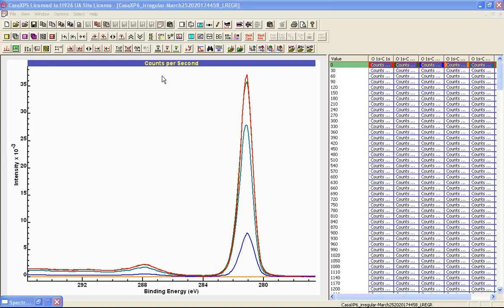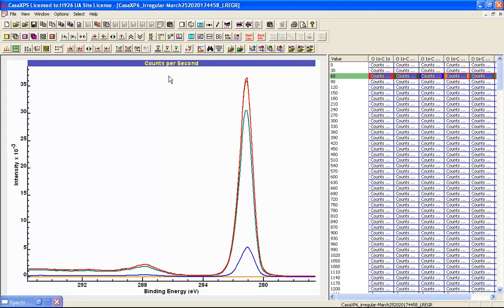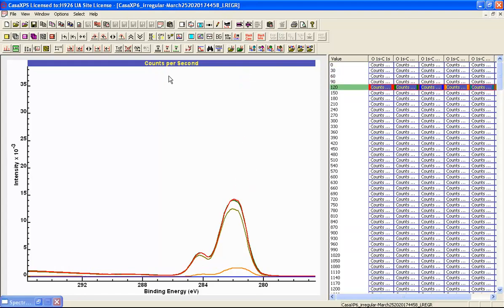A feature of using four vectors rather than two is that polystyrene can be represented by more than one polystyrene peak, and similarly there's an example of the PVP that is represented by a combination of these two vectors rather than a single vector.